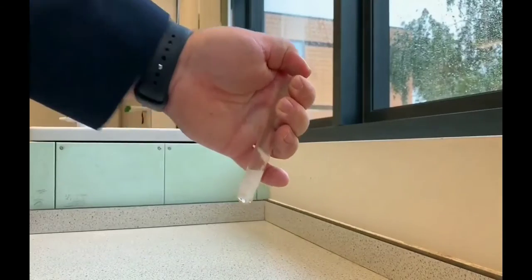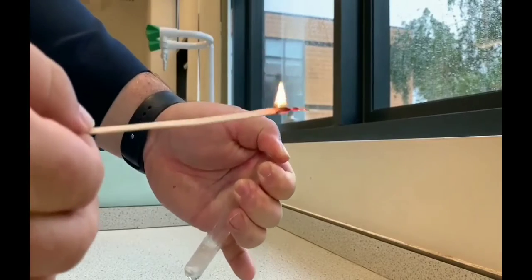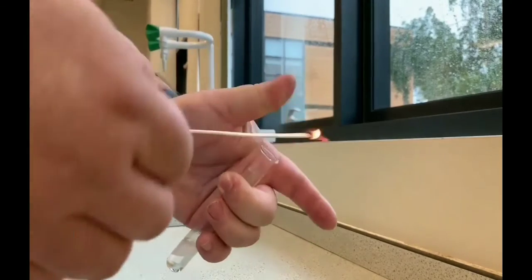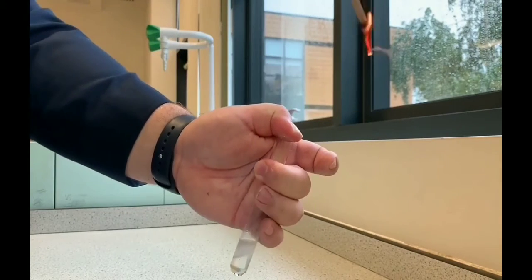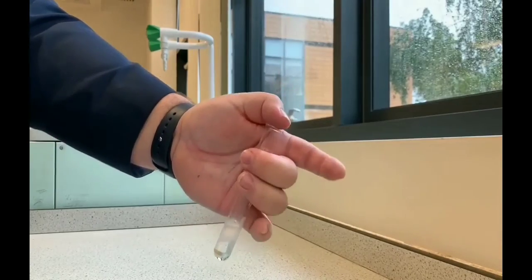So the test for hydrogen gas is when you light the actual gas, it should make a popping sound, more of a squeaky pop sound. Let's listen. There we go.